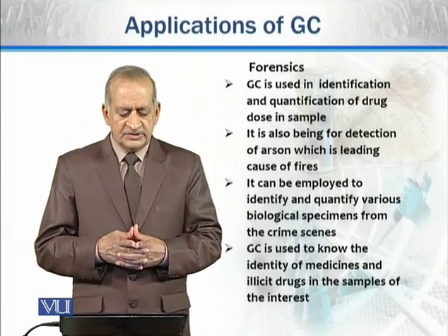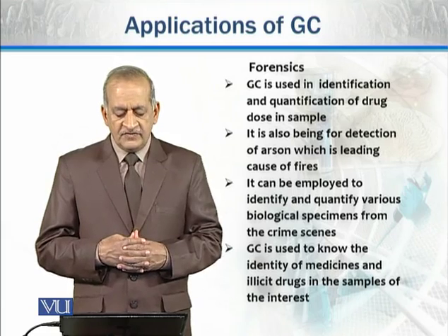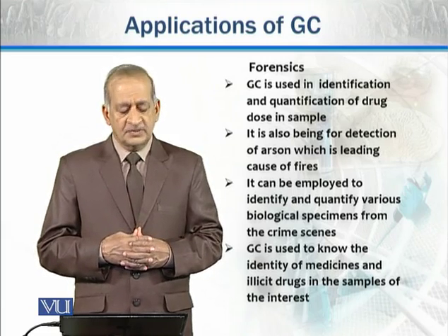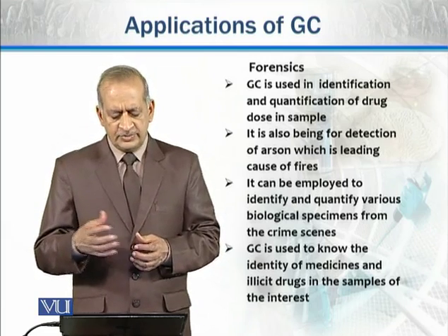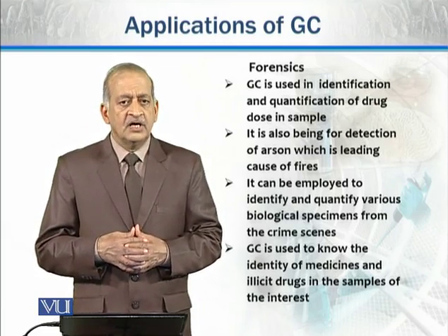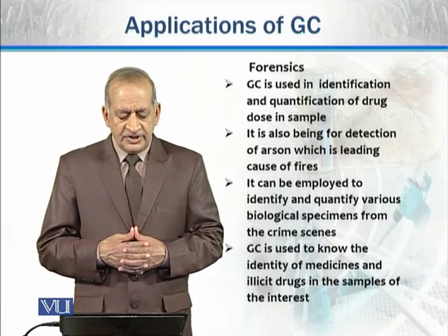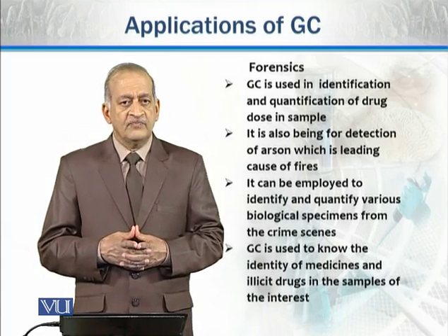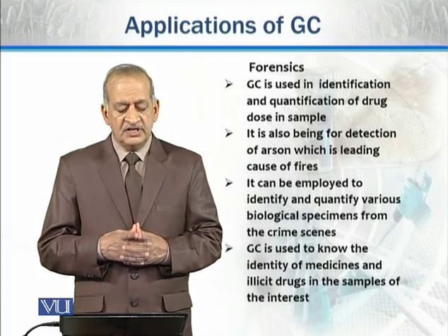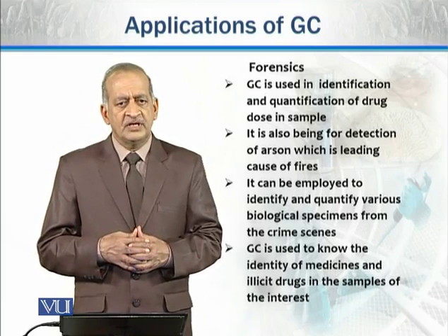Then it has also many applications in forensics. It is used in identification and quantification of different types of drugs present in samples. Different types of illicit drugs present in the sample are identified and quantified through this technique. It is also being used for detection of arson. This is a component which is a leading cause of fires which normally happen in life.